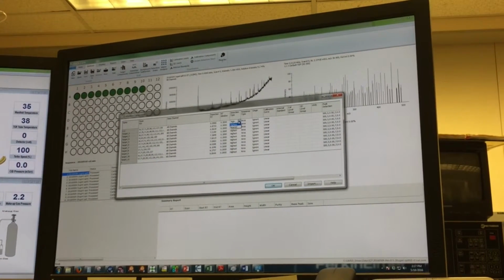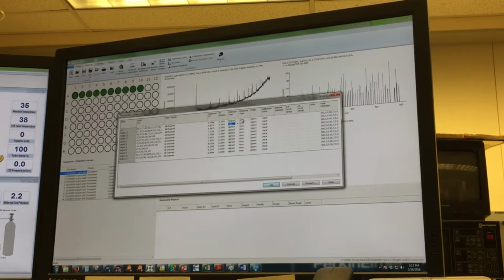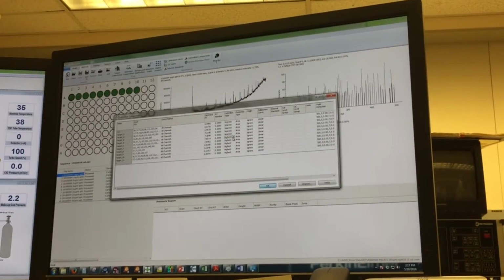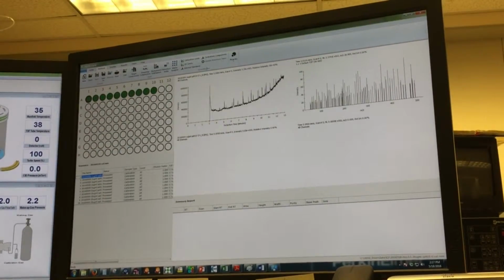Here is the detection type, you can click on nearest. You can do it more easily like this.